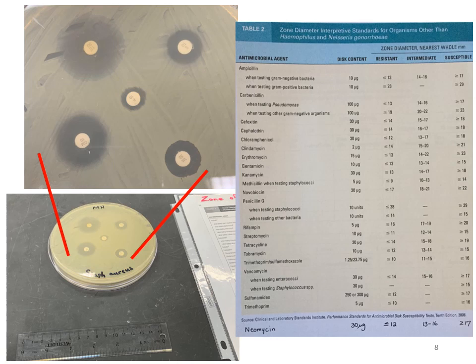Now, if you are not doing something ultra important, like working in a medical lab, you can also just take a look at this and analyze it without even measuring anything. This right here is the biggest zone of inhibition.